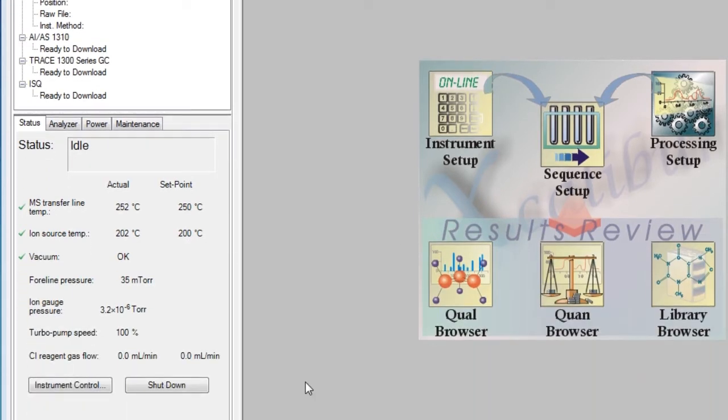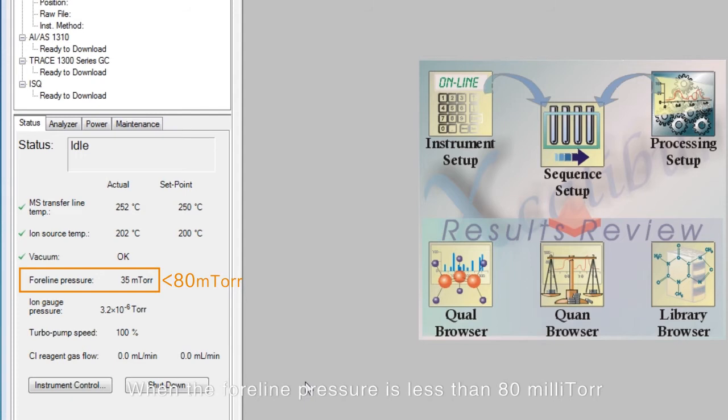When the foreline pressure is less than 80 milliTorr, you can do a leak check and then tune it.